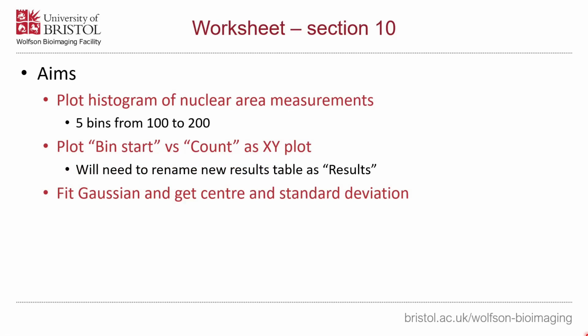For the final exercise, what we want to do is fit a Gaussian to the distribution of nuclear areas. In order to do this, we're going to have to go through a couple of steps, mainly because the distribution window doesn't have the ability to fit a plot.